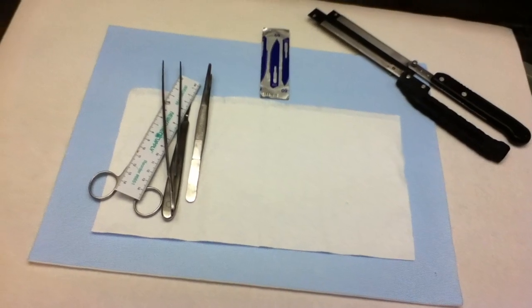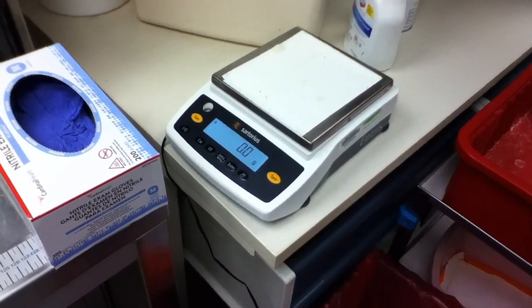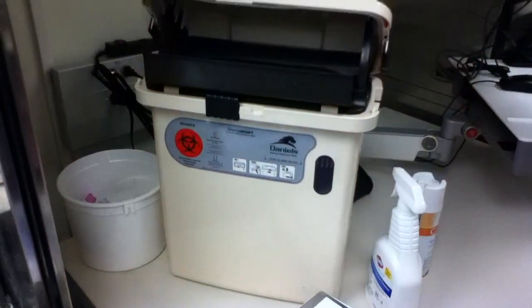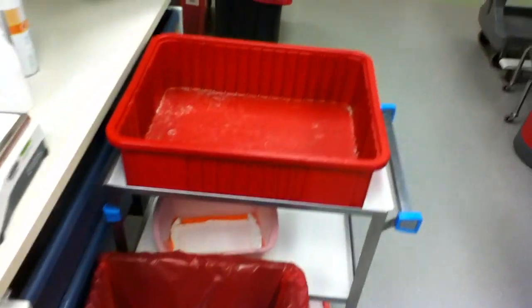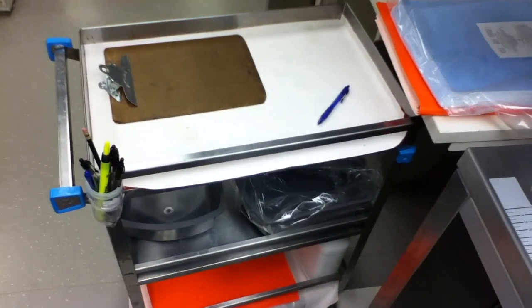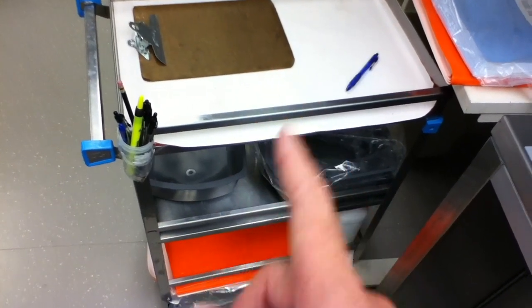You need a scale readily available at your workstation. I have mine on a little table nearby — it's a nice scale that doesn't time out and is easy to tare. A large sharps container makes it easy to throw blades in and keep moving. I keep bleach and detergent close, and a waste container very close to the grossing bay to minimize dripping. I have a spot for empty completed containers and a specimen cart with a clipboard for the tech sheet, plus a cup on the cart for pens.